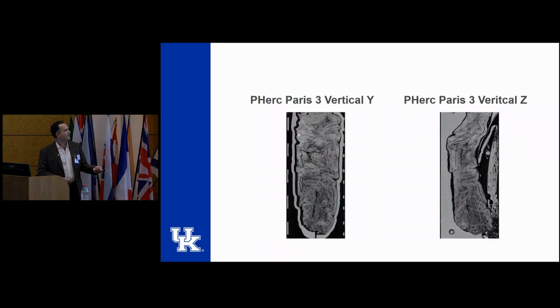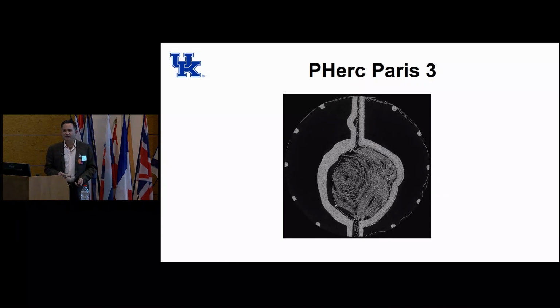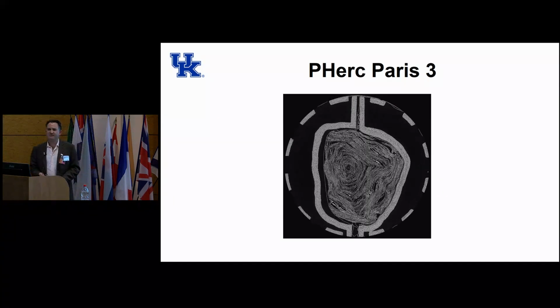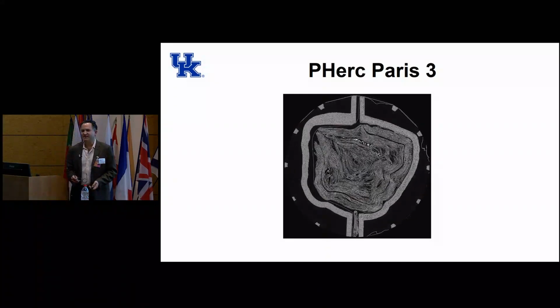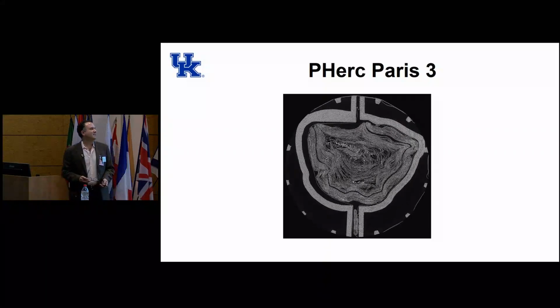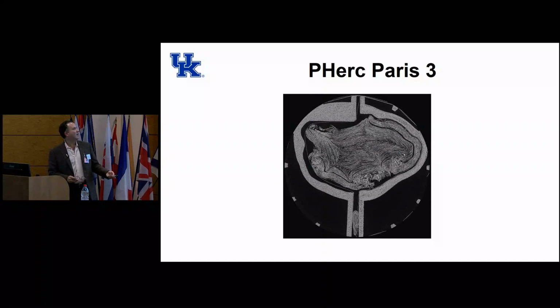Come on. Oh, and finally, here's just some vertical slices I wanted to show you as well. And we got some nice animation video to show you the internal structure. It's going to look kind of like what we're already used to from prior imaging. It looks like a mess in terms of thinking about how to go about segmenting that in the end. But that's part of the fun.